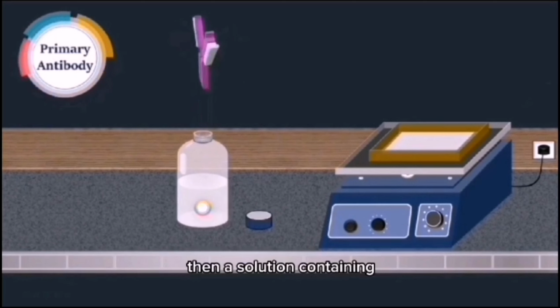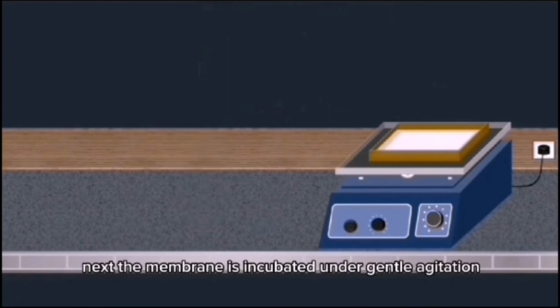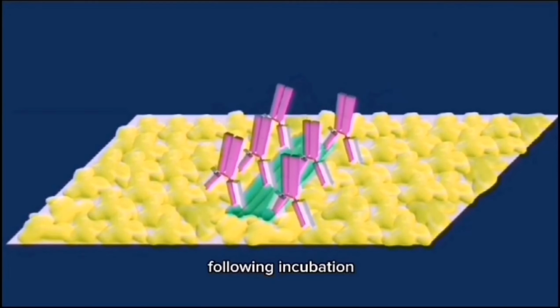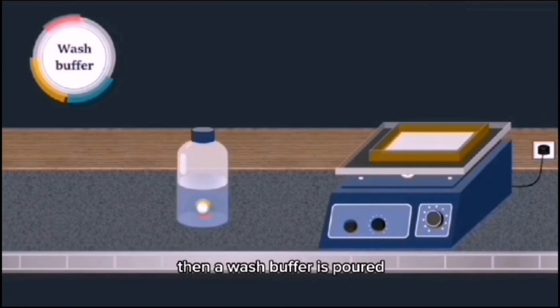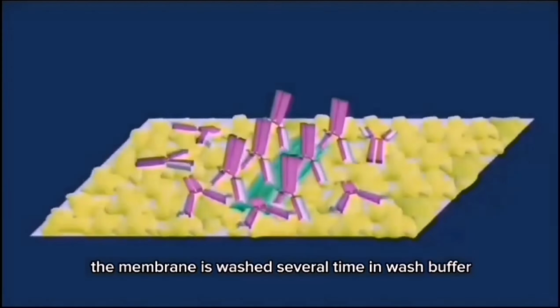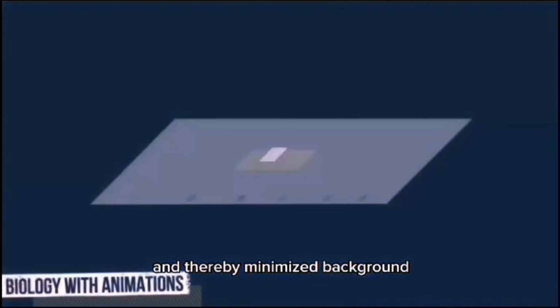Then a solution containing the primary antibody is poured into the tray. Next, the membrane is incubated under gentle agitation. The primary antibody binds to the specific target protein. Following incubation, the primary antibody solution is removed, then a wash buffer is poured. Next, the membrane is incubated on the rocking platform. The membrane is washed several times in wash buffer to remove unbound primary antibodies and thereby minimize background.